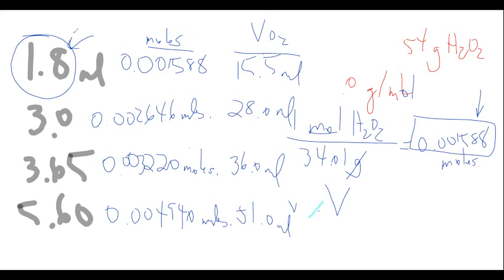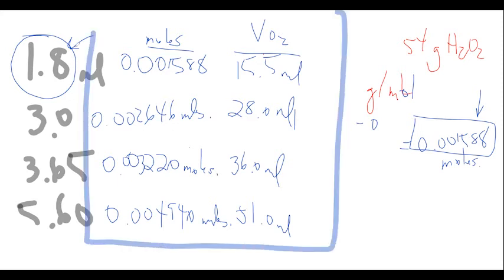It went over 50, so that's going to be an estimate. Then I go to my graphing program, whatever it might be, and I put moles as my X, and remember my volume is going to be my Y.